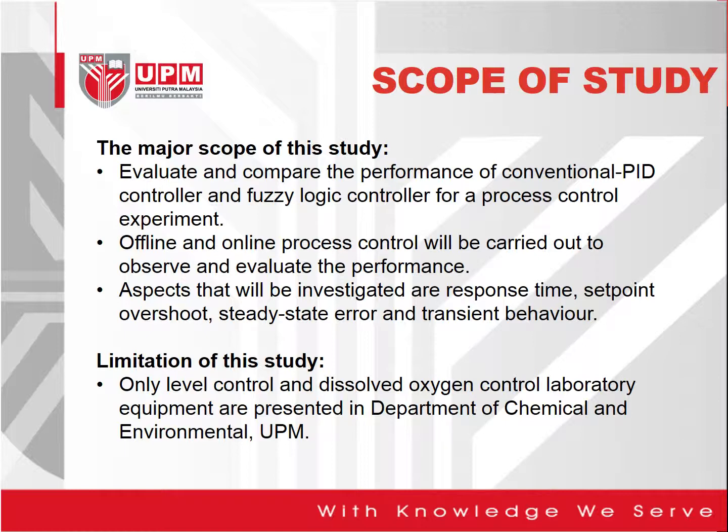However, this study is limited by the choice of control experiment. This is because only level control and dissolved oxygen control laboratory equipment are presented in Department of Chemical and Environmental Engineering (UPM).